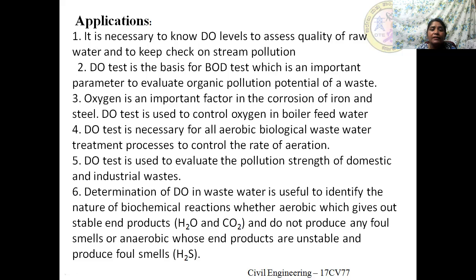DO test is the basis for BOD test, that is biochemical oxygen demand. Because in this biochemical oxygen demand, we determine the initial DO content, and after 5 days of incubation, we determine the final dissolved oxygen content.